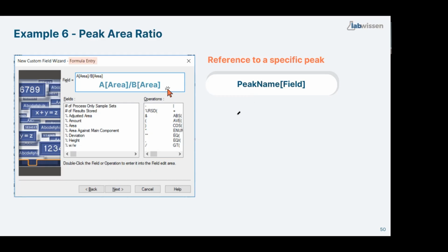To memorize it, what helped me is that I always say it's like in English, Lisa's pencil. Just Lisa's pencil. What is the name? It is Lisa, and then you say field is pencil, Lisa's pencil. That's why peak name comes first, then comes field.